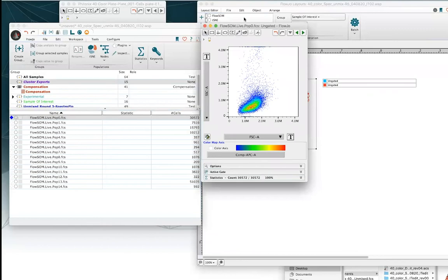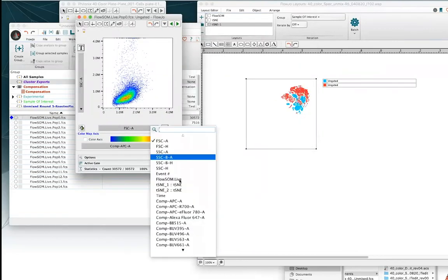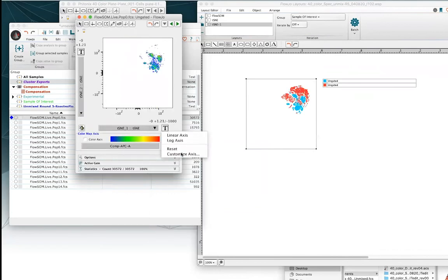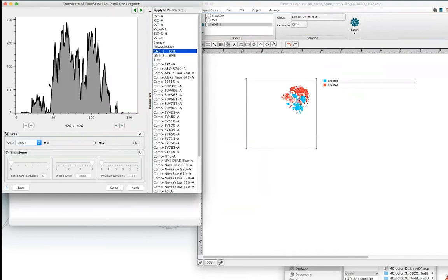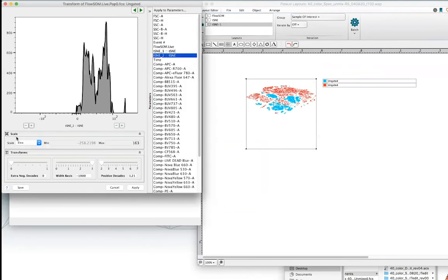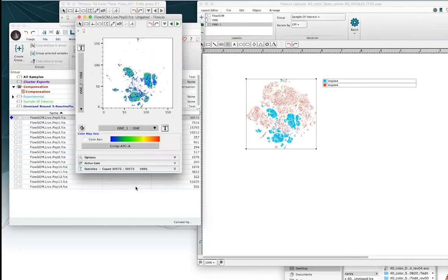Notice that t-SNE rescaled to the scaling of our population here, so we need to actually adjust that. Looking at t-SNE1 and t-SNE2, I can very quickly adjust the scale by going in here and choosing a linear scale — and that looks pretty nice. I'll just leave it as is. Now I need to do the same thing for t-SNE2: just switch to a linear scale and that ought to scale it fairly nicely. We may want a little bit of extra white space on either side, but I'll leave that for another lesson.